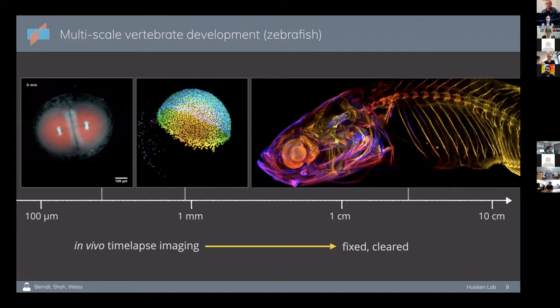And you basically want to animate that tissue and use the time-lapse information to go back in time. So I think that's one of the challenges, to be able to do this multimodal imaging using different inputs, ideally extracting as much as possible from one specimen.